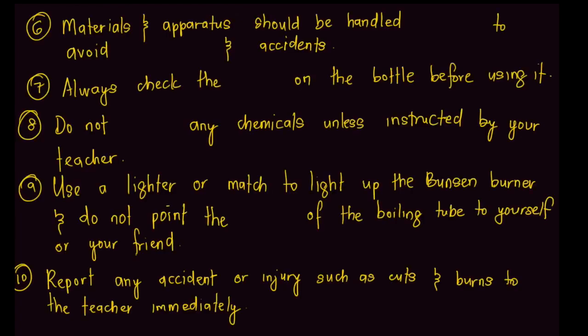Moving along, materials and apparatus should be handled correctly to avoid damages and of course accidents. Always check the label on the bottle before using it. Do not taste any chemicals unless instructed by your teacher.